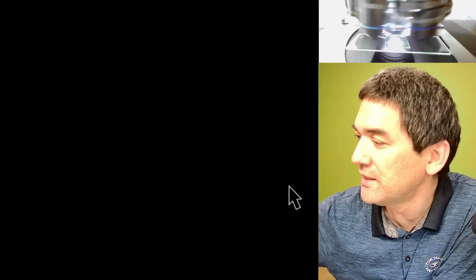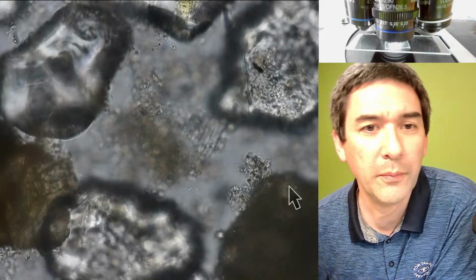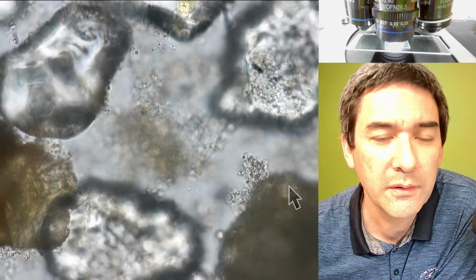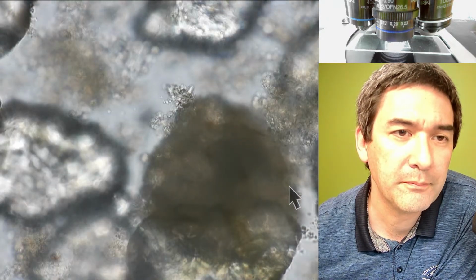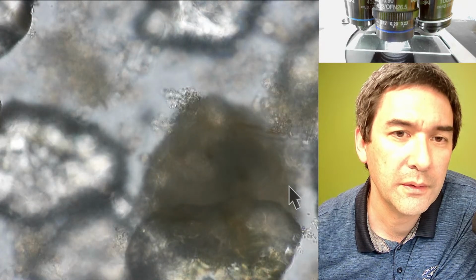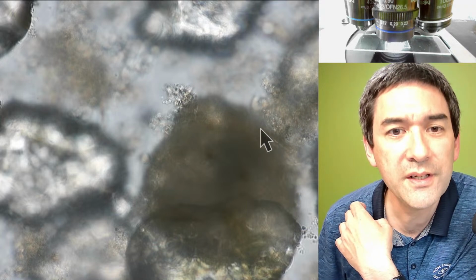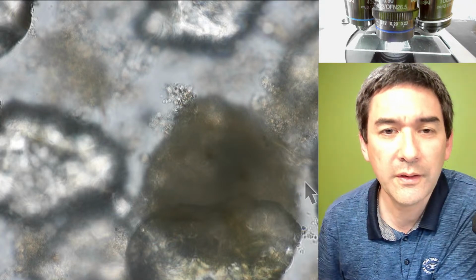I'm going now to 60. Let me go up with the intensity. I think it must be a diatom, kind of hiding a little bit. Yep, do you see this? Oh, here as well. Oh, here we go. Do you see this guy here? This long thing?